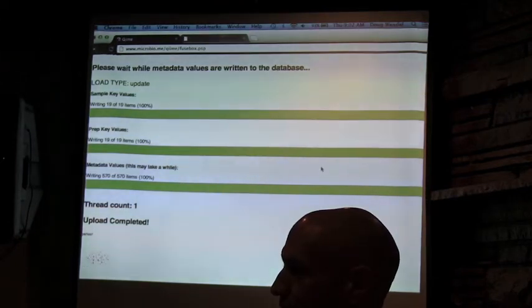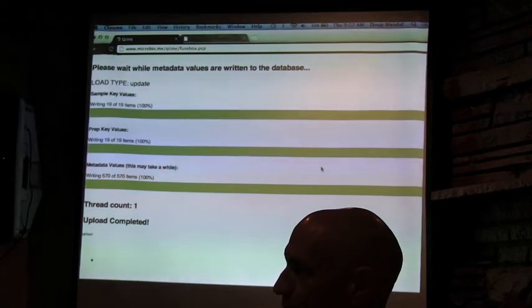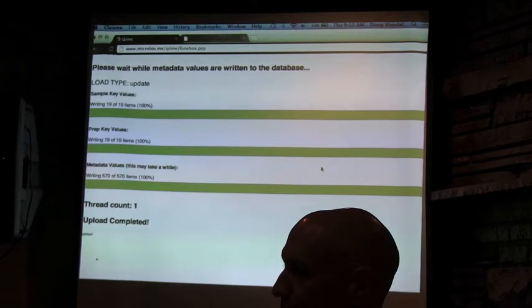So that's how we get things like making sure the ontology annotations are consistent, making sure the parameters are recorded in a consistent way, and that kind of thing. So it's one of these things where probably no automated system will ever really be able to do it. You need to have a person looking at it and figuring out whether it makes sense, as well as being technically compliant with the standard.